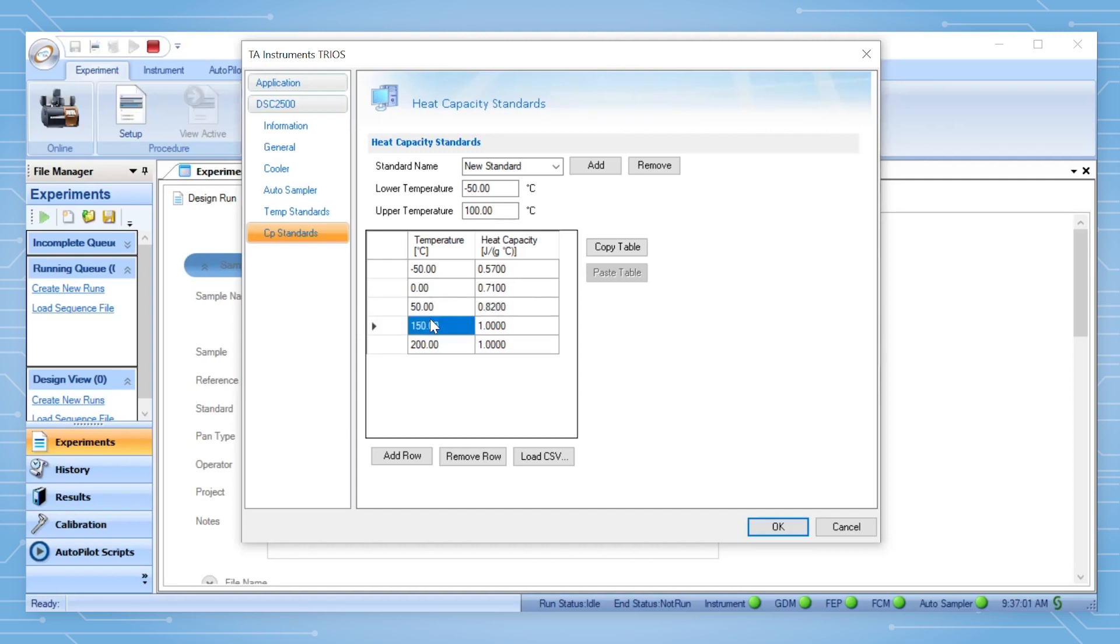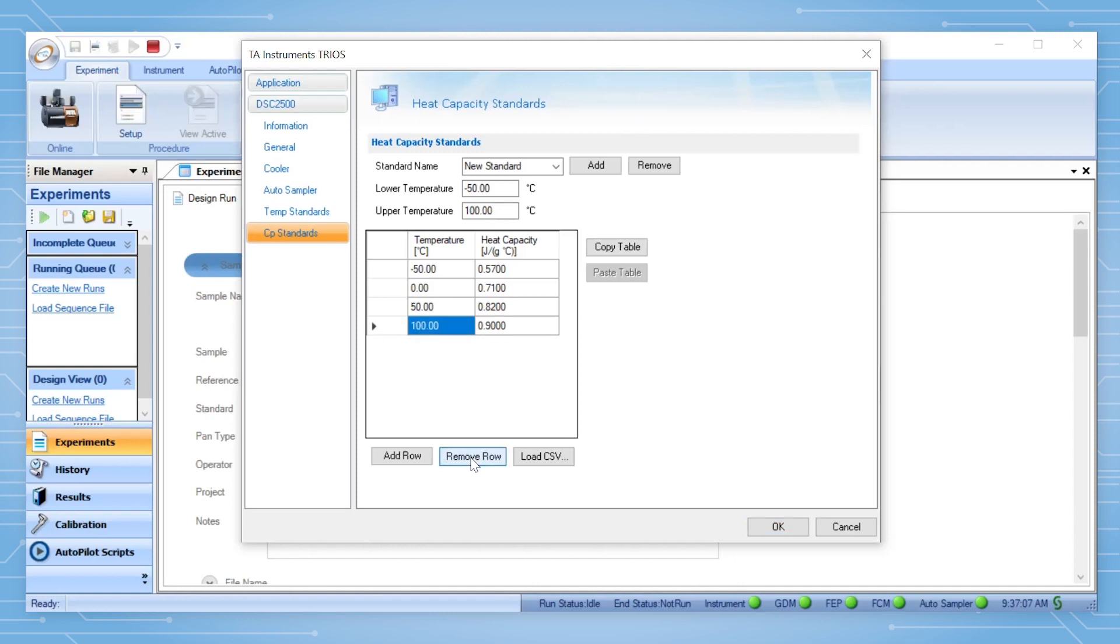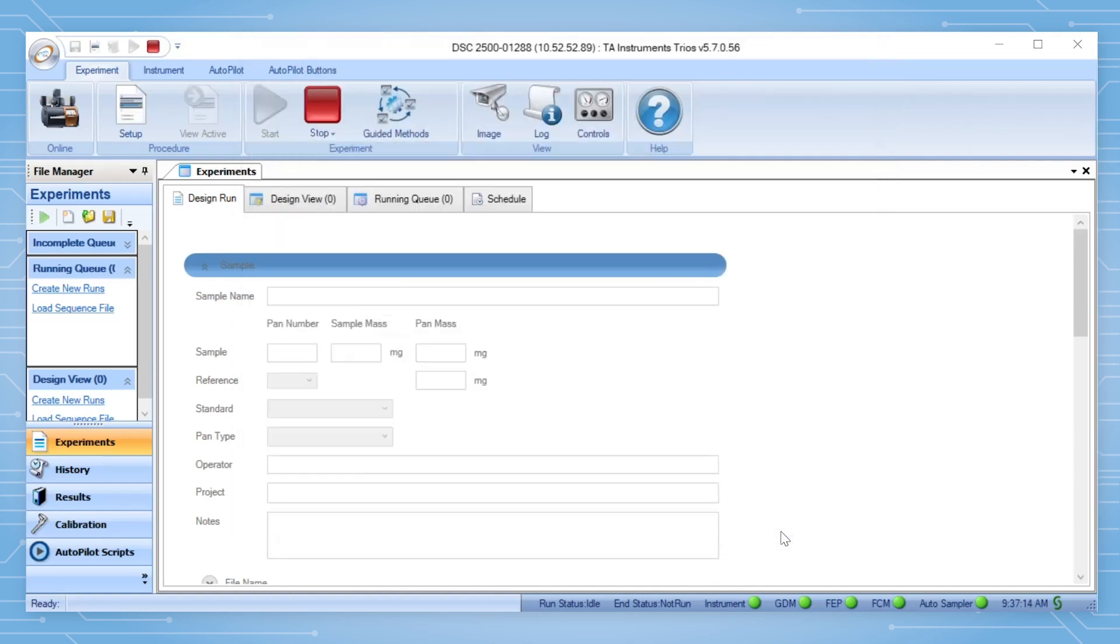You can then manually enter the heat capacity values or load a CSV file by clicking Load CSV. Then click OK to save changes.